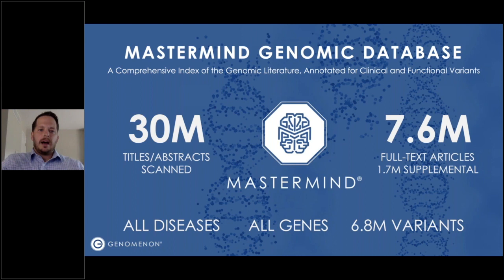So I'll begin at a high level and say that Mastermind, the user interface, is a decision support tool meant to be used in clinical workflows in its professional version.